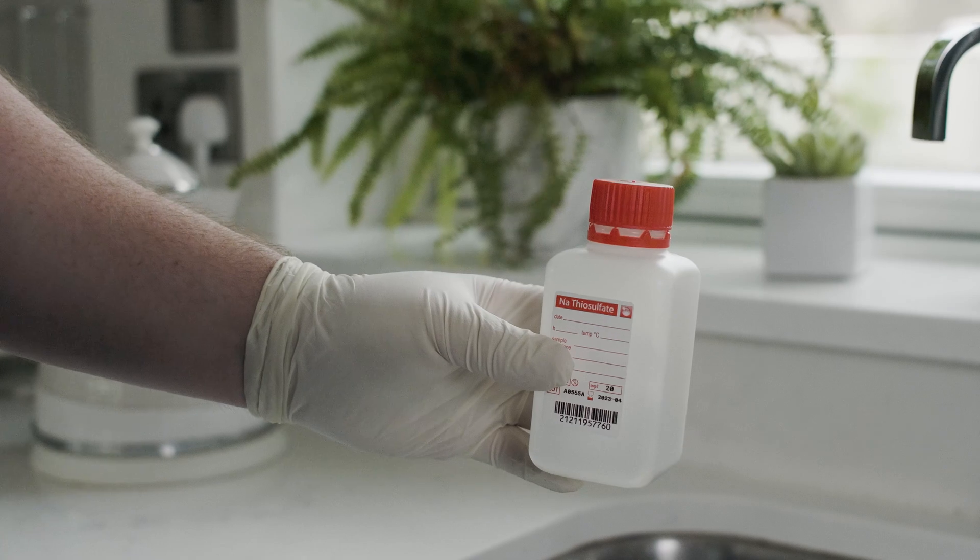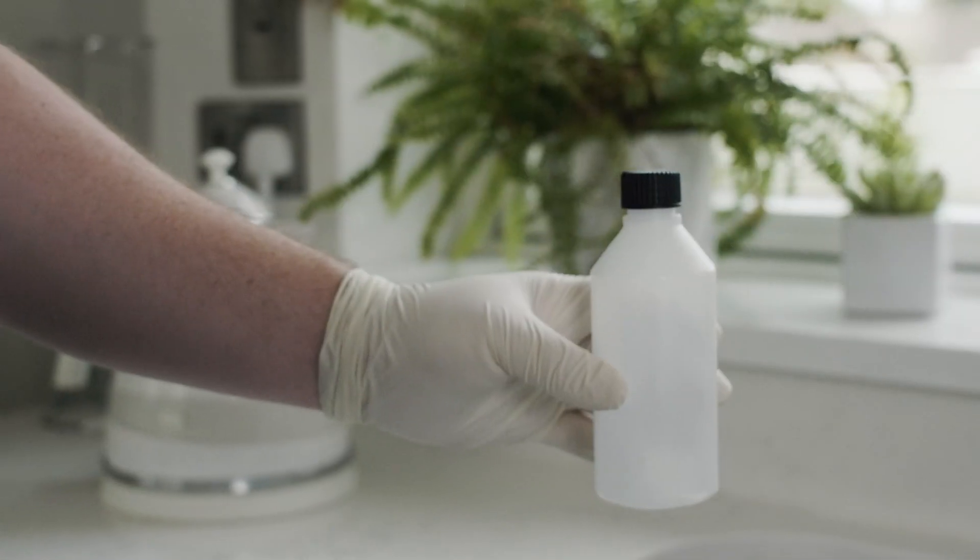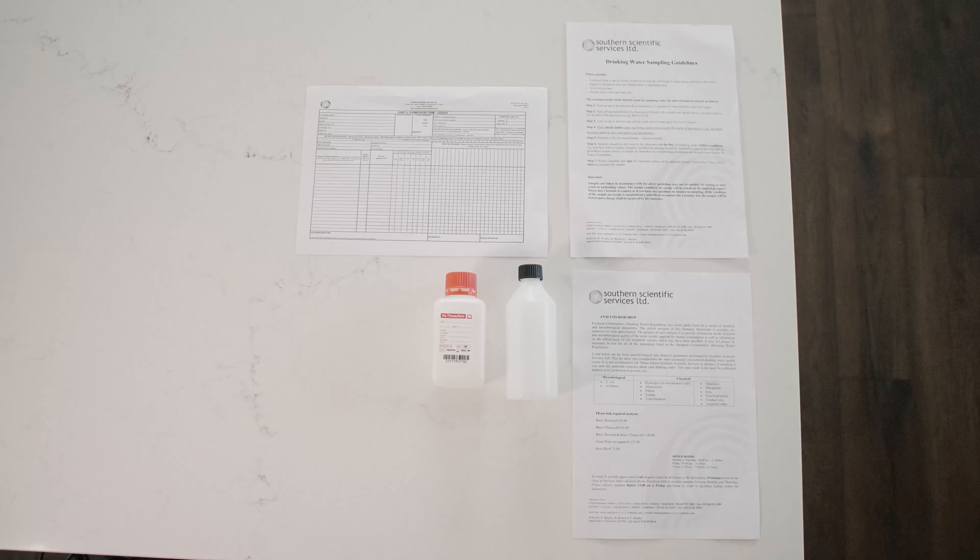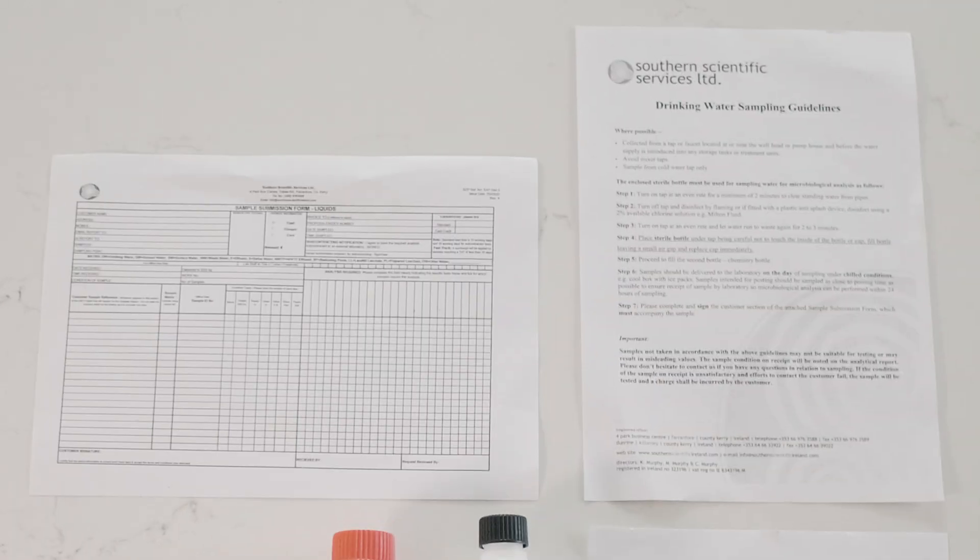Notice that it comes with two different bottles. The red cap bottle is for the microbiology test while the black cap bottle is for the chemistry test. To make the process as smooth and efficient as possible it also includes sampling guidelines and a reception form.